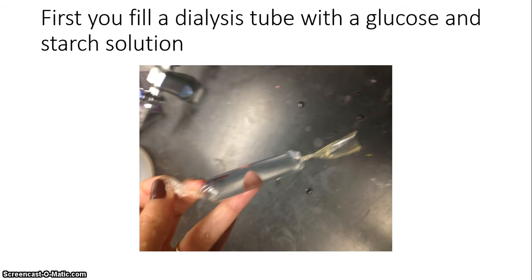So if you remember, the first step was to fill some dialysis tubing with a glucose and starch solution. The dialysis tubing represents a cell membrane or a selectively permeable membrane. It has tiny pores in it, and so it will let certain substances pass through.